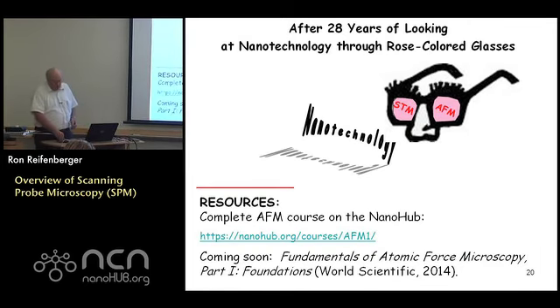So, I've been looking at this topic called nanotechnology for 28 years, and I've looked through it through rose-colored glasses, because the glasses I use are based on scanning probe microscopy. My entire research has been based on looking at nanotechnology through the eyes of scanning tunneling microscopy and atomic force microscopy. And it's been just an incredible adventure watching how this whole field has developed over those years.